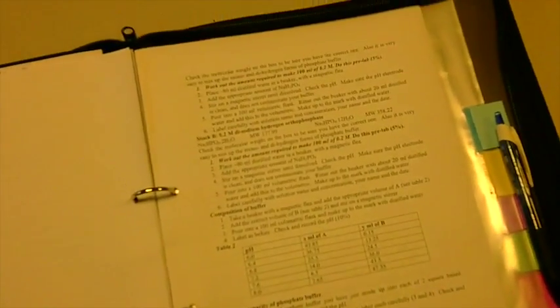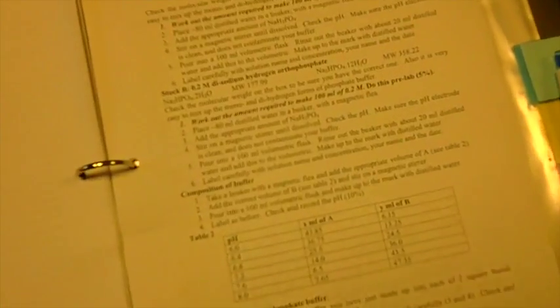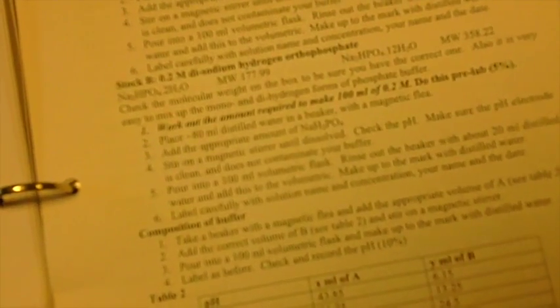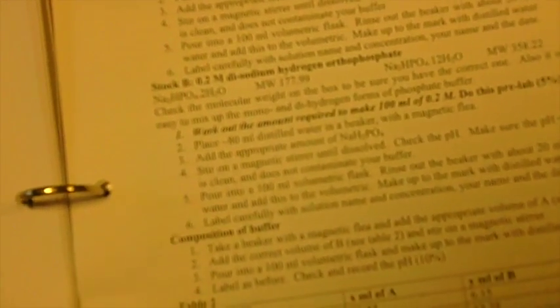As noted in your handbook, the second student must now make up stock B. You are required to work out the amount required to make 100 ml of this 0.2 molar solution which you need to do pre-lab and follow the exact same steps just shown.